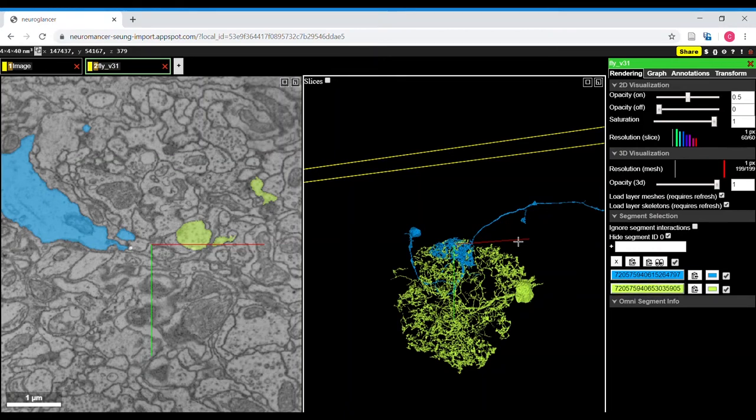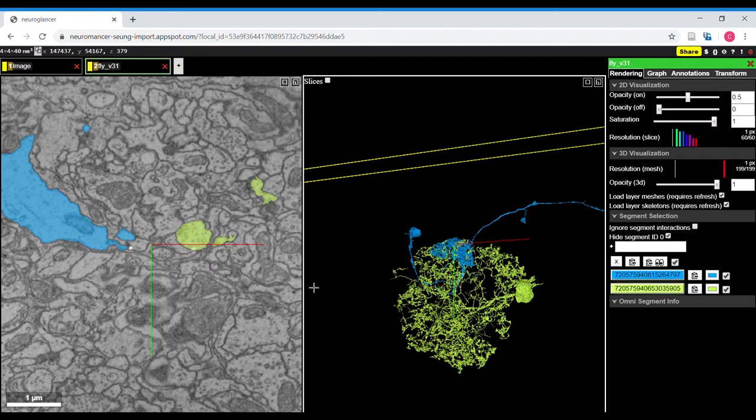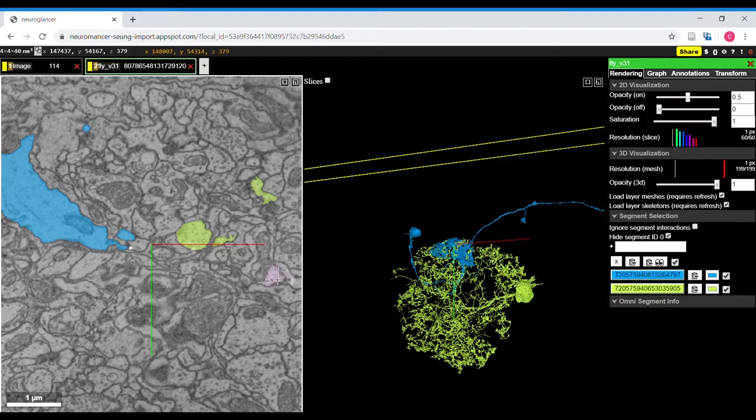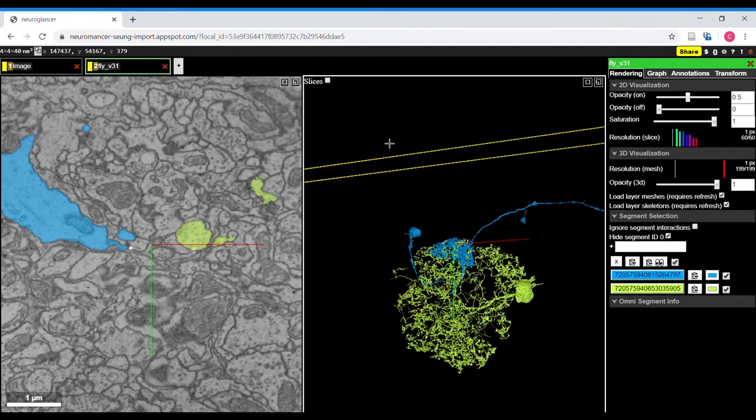This is an introduction to basic navigation in Flywire. On the left you see electron microscope images, the 2D view, and on the right you see a 3D view of the segments that I've highlighted in blue and yellow.